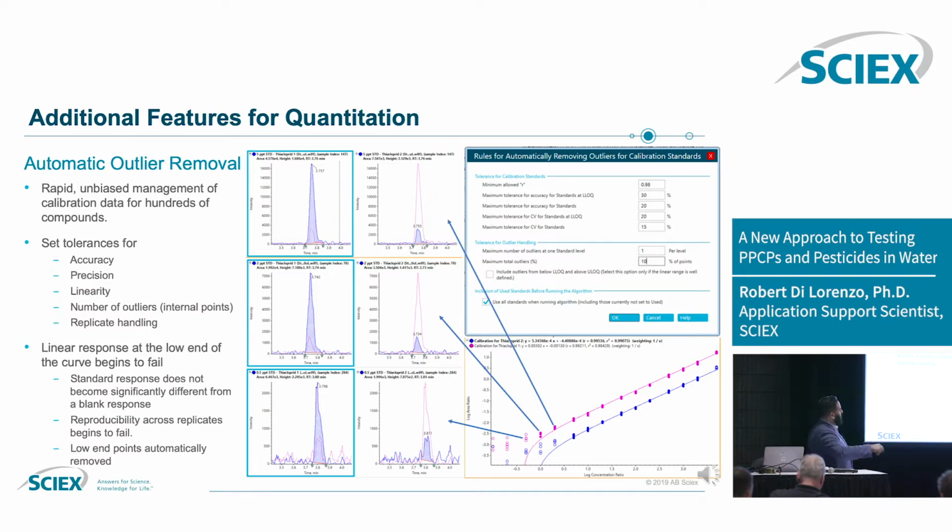So you can see down at this low end, these samples really didn't differ any from our blank samples, and so you had really poor quantitative performance down at a couple thousand counts. The software recognized that the R-squared deviated if you included those points, they were eliminated, and you can see linearity all the way through. And this is completely unmonitored once you set it up in your system. So we remove those points automatically, and it will work for every single compound in your sample.